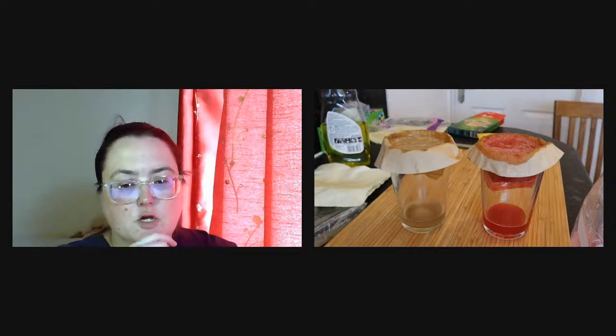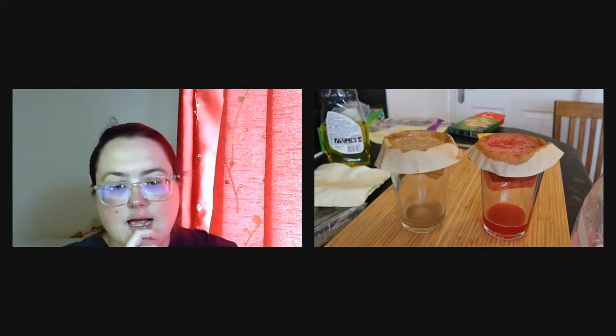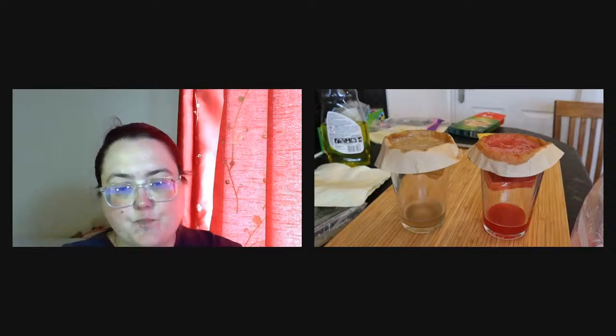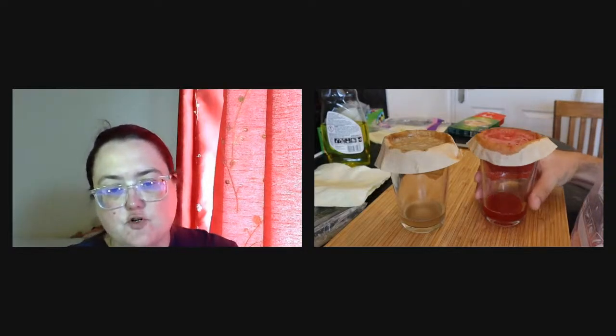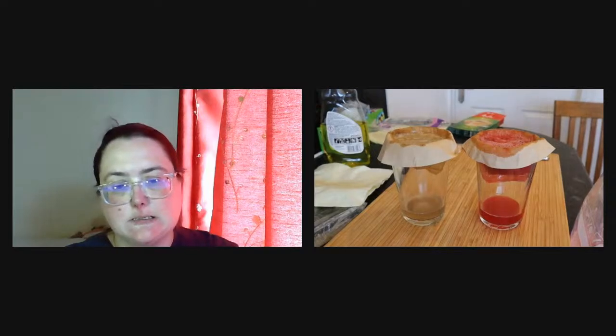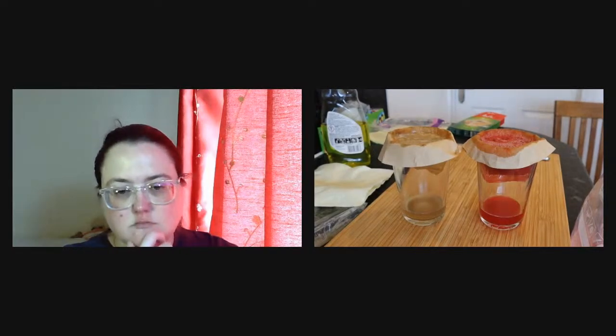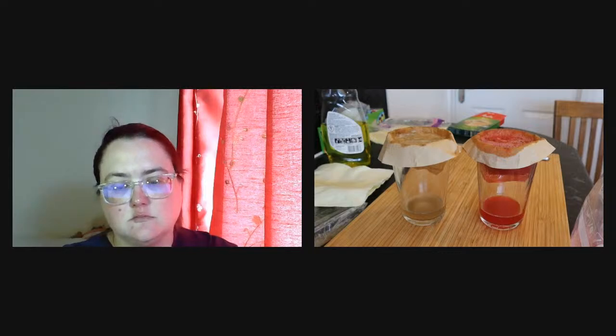Brilliant, Remy. I'm sorry to interrupt you, but can we go back to the experiment a bit? I see that the liquid coming from the strawberries is red. Does that mean our DNA will be red as well? We will see at the end of the experiment. If any of you have any suggestion about what the color of the DNA would be, you can put a comment in the chat. We will be happy to have any comments in there.